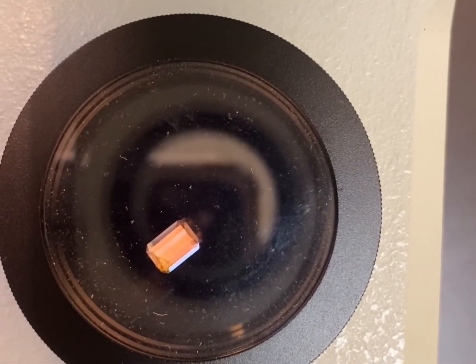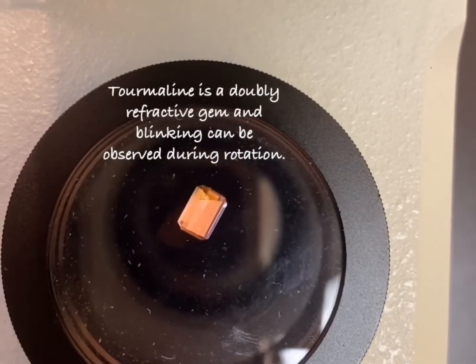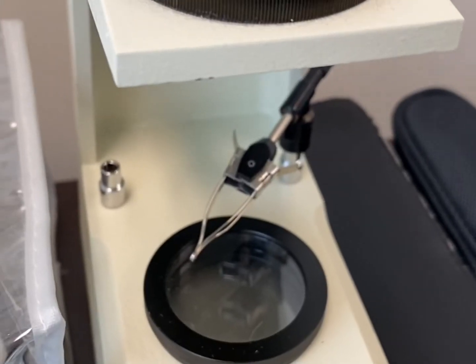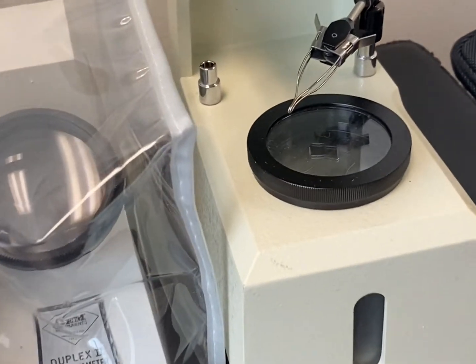I'm going to use the faceted tourmaline because it gave a really nice crisp blinking. As you can see as we rotate it, it's blinking nicely, telling us that this gemstone is doubly refractive. In a future video we will cover a confirmation test and optic character.